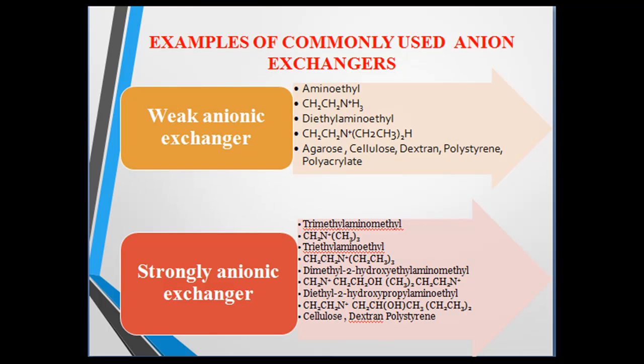Bonded phase ion exchangers are suitable for HPLC, containing a wide range of ionic groups, and are commercially available. Porous varieties are used on polystyrene, porous silica or hydrophilic polyethers and are particularly valuable for separation of proteins.